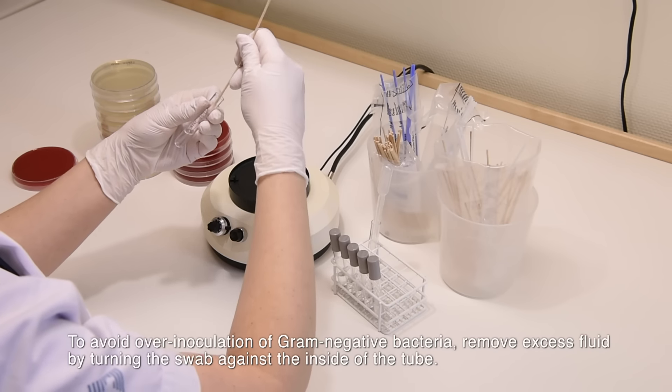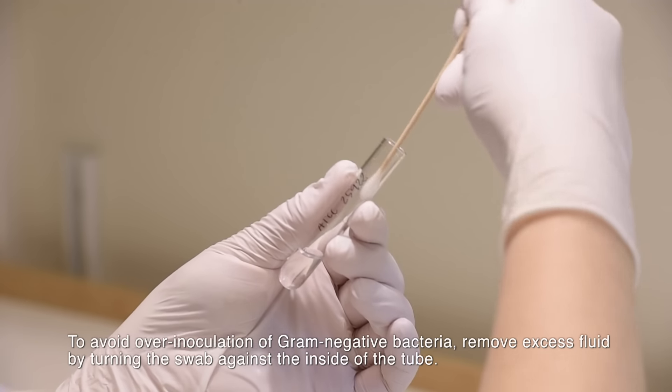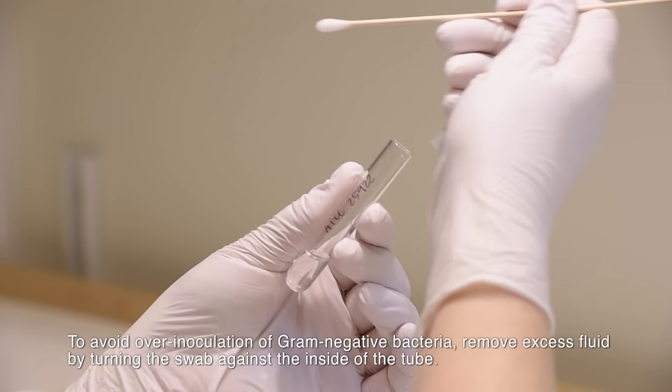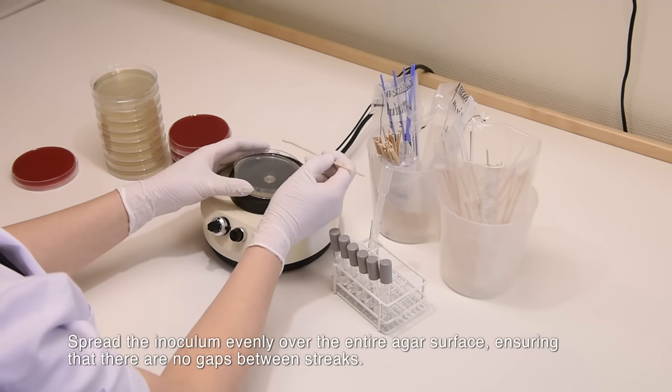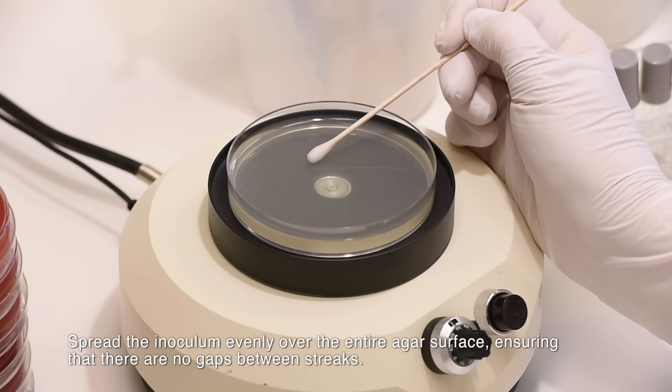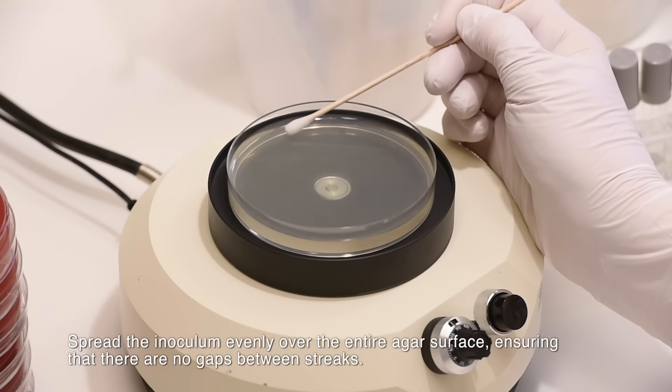To avoid over-inoculation of gram-negative bacteria, remove excess fluid by turning the swab against the inside of the tube. Spread the inoculum evenly over the entire agar surface, ensuring that there are no gaps between streaks.